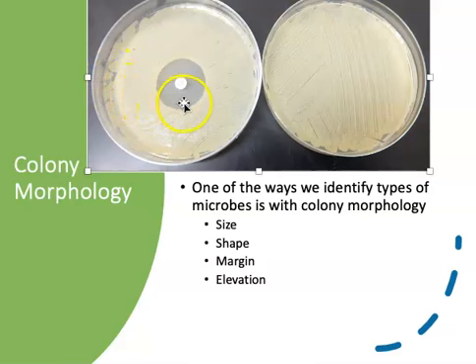And then they took this little disc here that happens to be impregnated with an antibiotic. We can't tell what kind of antibiotic it is, but the disc is placed in the center of the plate, and then the whole plate got put into an incubator for approximately 24 hours. This is what the plate looked like the next day.